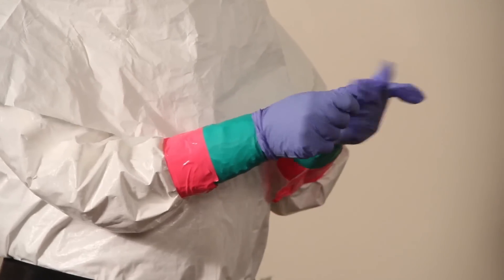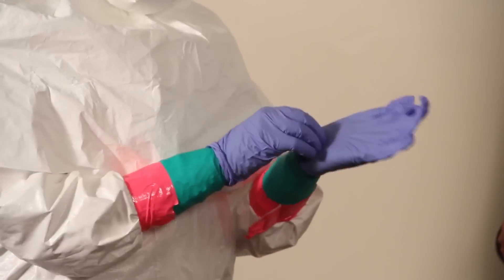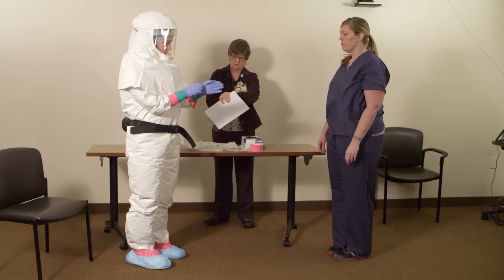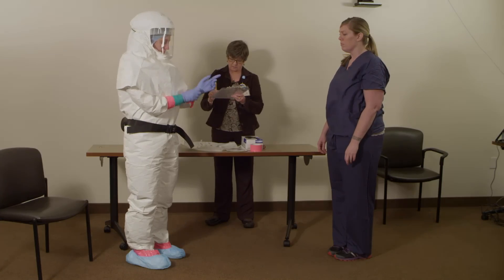Don your third pair of gloves — these are the exam gloves. Your safety officer will record your donning time, and then you are ready to provide patient care.